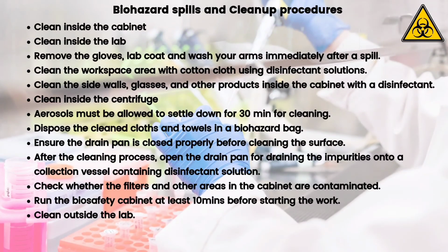How to handle biohazard spills and cleanup procedures. Inside the cabinet, if there is any spill, immediately stop the work and inform the supervisor or qualified person about the issue. Inside the lab, inform other professionals to stay out of the laboratory area due to the spill. Make a note of caution on the door as entry restricted. Remove the gloves and lab coat and wash your arms immediately after a spill.